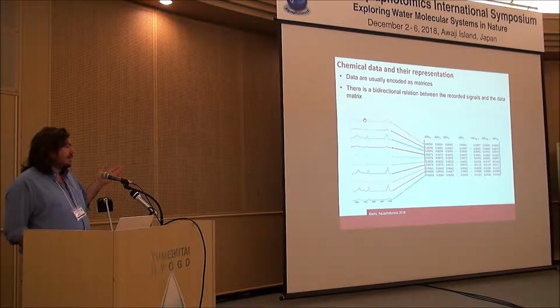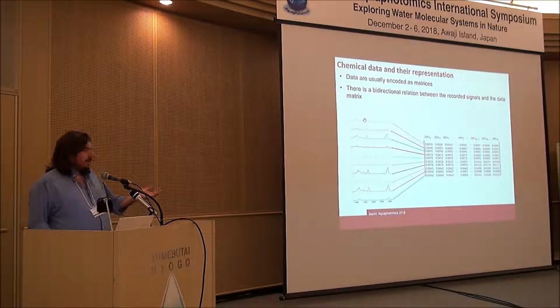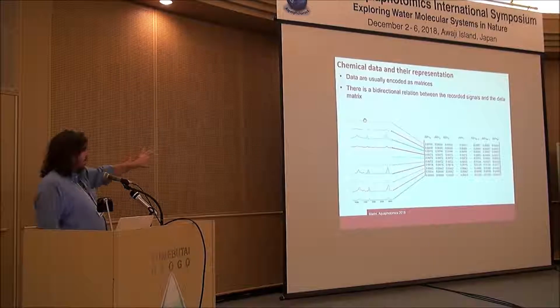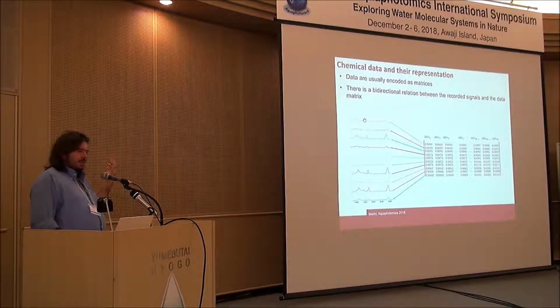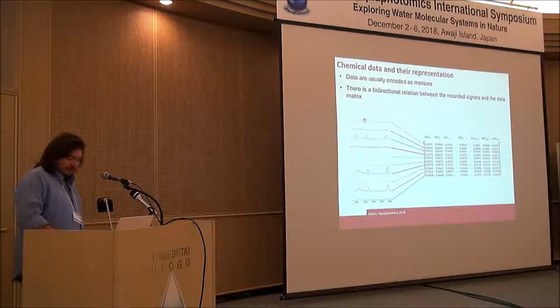Also, given the matrix of experimental data that we have, there is a more spectroscopically oriented way of representing it. That would just mean taking the data in the matrix and making the same spectra, the same graphical representation that you see there. So it would be just taking the opposite transformation than we've seen in this slide.